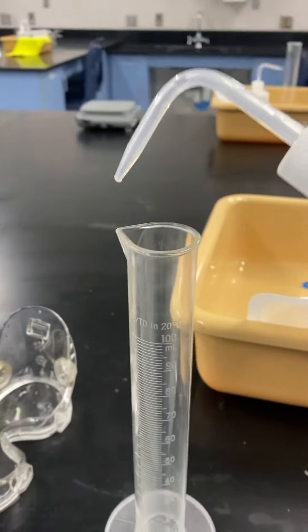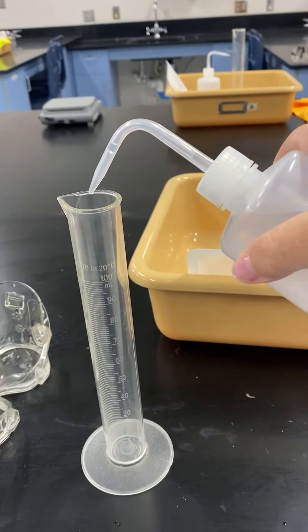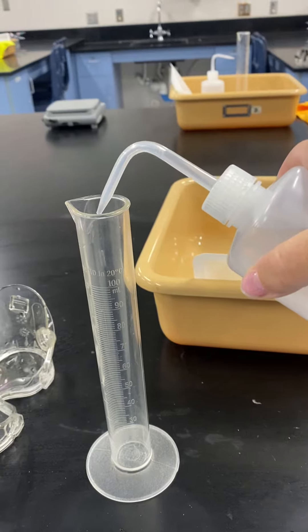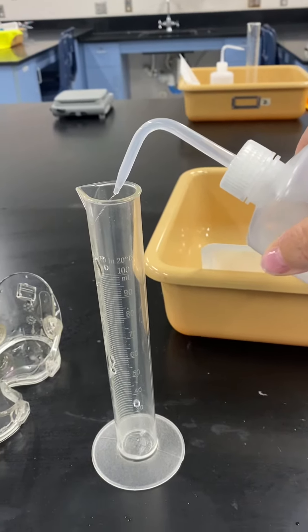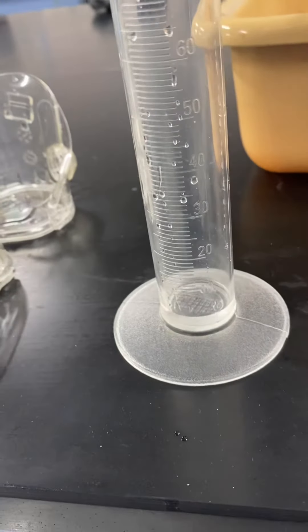So I'm going to take the bottle in my hand, position it over the opening of the graduated cylinder, and I'm going to squeeze and see how the water comes right out. So we're just going to do this until it fills up to 20 milliliters.